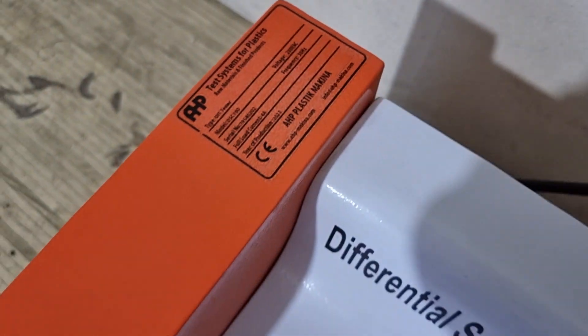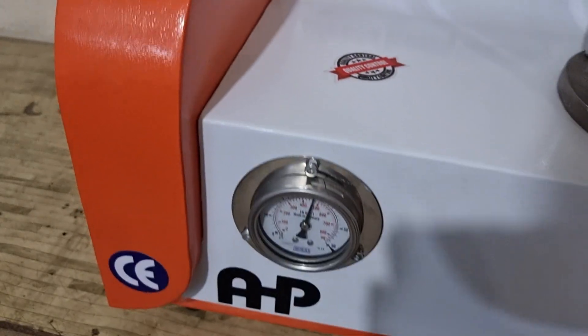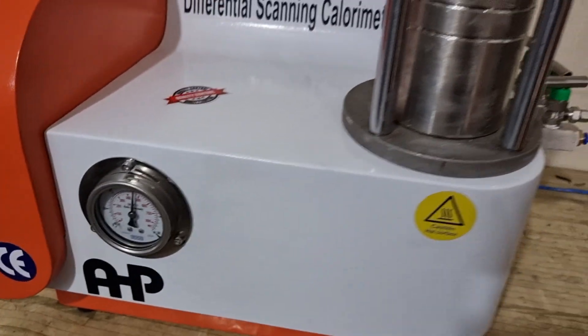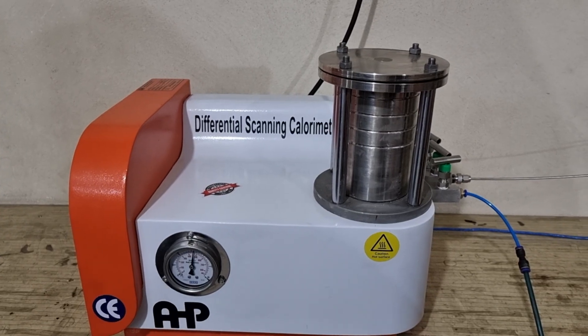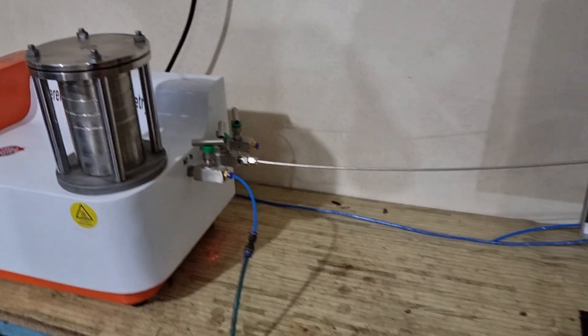This is the high pressure OIT tester from AHP Plastic Makina, now on the test. You can see the oxygen pressure is about 34 bar. It is mainly used for testing polyethylene products such as geomembranes and geotextiles.